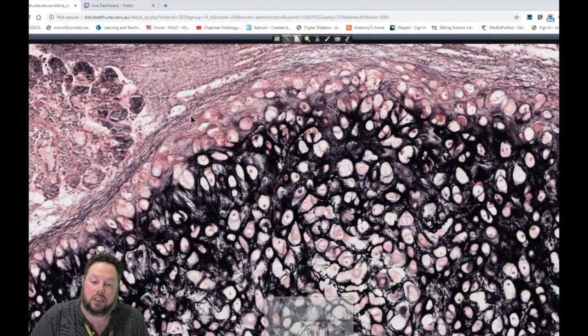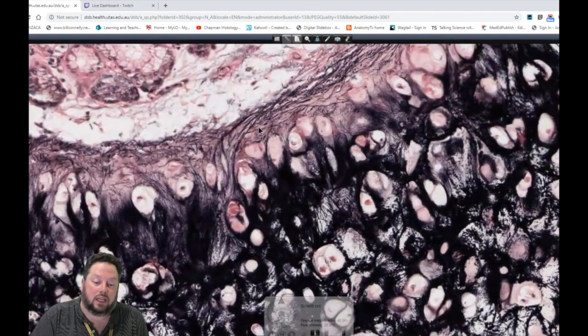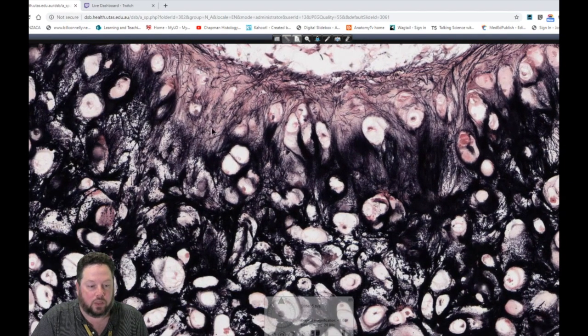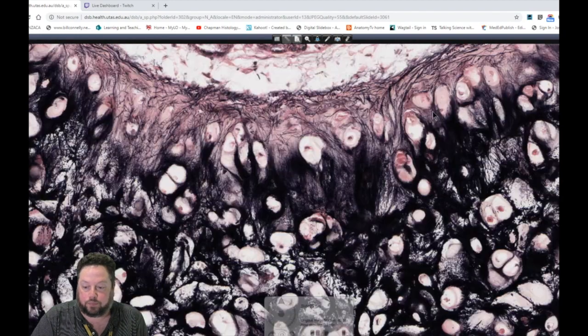Out here, we've got the perichondrium. So elastic cartilage has a perichondrium, so it can undergo both interstitial and appositional growth. And you can see this origin of these elastic fibers extending down from what will be the outer fibrous layer of the perichondrium and extending down into the matrix itself. I think it looks kind of cool seeing all these elastic fibers, and it's so dense obviously that this material accumulates this stain very, very densely in the matrix itself.